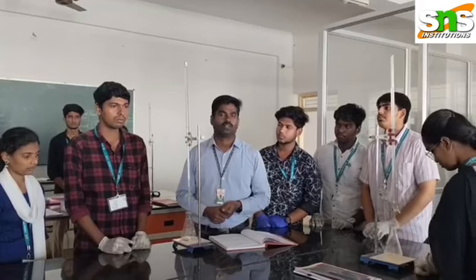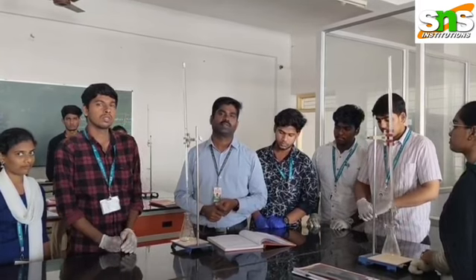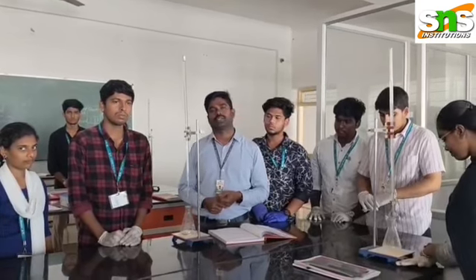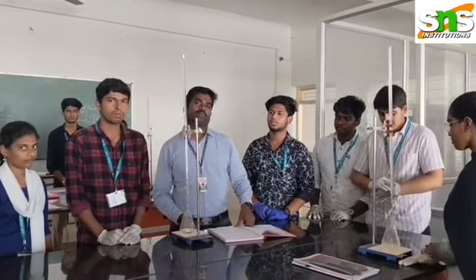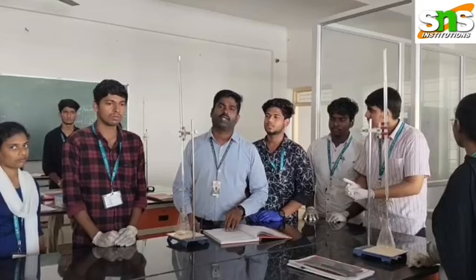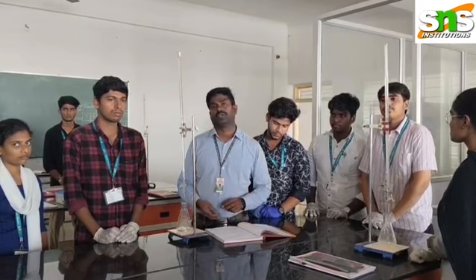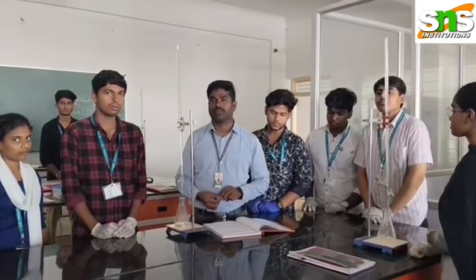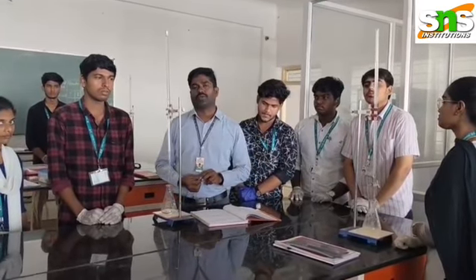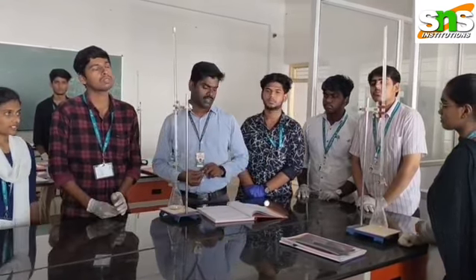Those who are studying in the B.Pharm first semester as per PCI syllabus, in the first unit, have the preparation and standardization of different strengths of analytical solutions. For this relevant practical, today we are going to perform the preparation and standardization of 0.1N sulfuric acid. For only 250 ml, we need 0.1N sulfuric acid.